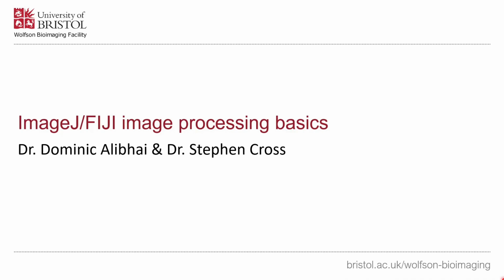This is the second part in our image processing and analysis in ImageJ Fiji course. I'm Stephen Cross, I'm from the Wolfson Bioimaging facility at the University of Bristol. In the first video, Don took you through the basics of image acquisition and processing with a focus on light microscopy. In this video, we're going to continue this and see how these principles apply to ImageJ and Fiji.